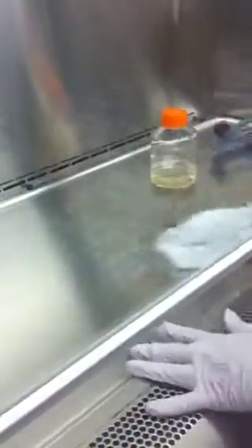And while you're wiping it down, just don't stick your head into it. It's something that a lot of people do when they start out. It's really hard to do this.